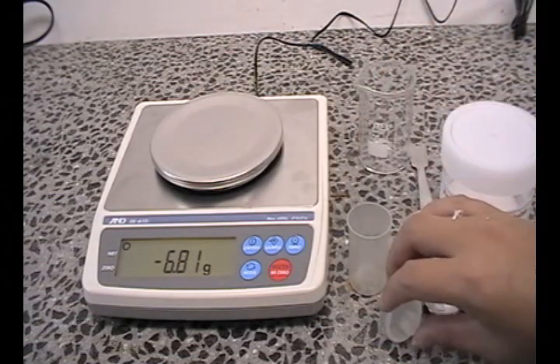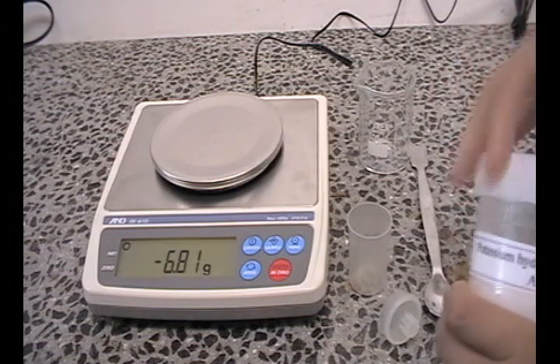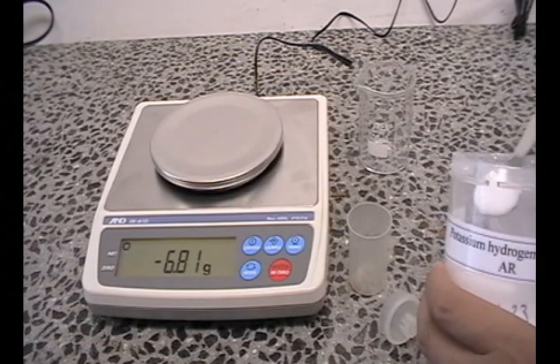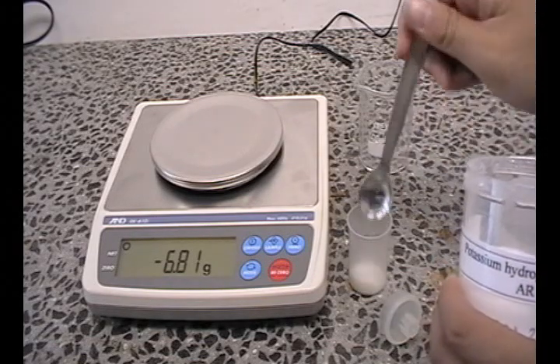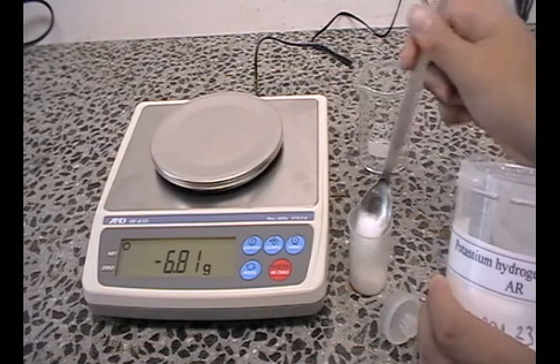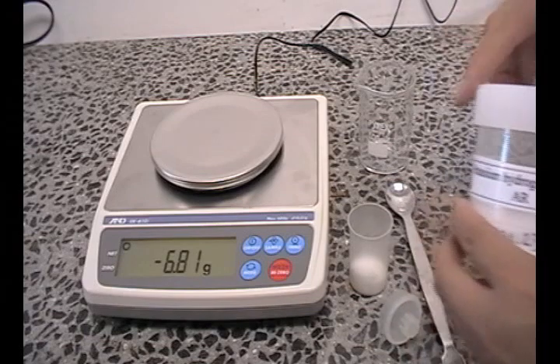At this point, you need to estimate what approximately 4 grams could look like. Using a spatula, transfer what you think approximately 4 grams could be into the empty weigh bottle. When you are done, place the lid back onto the substance bottle.